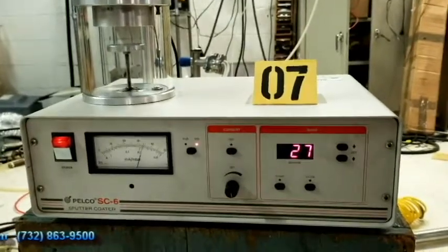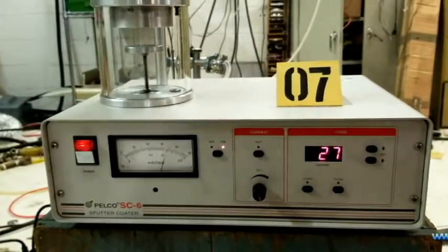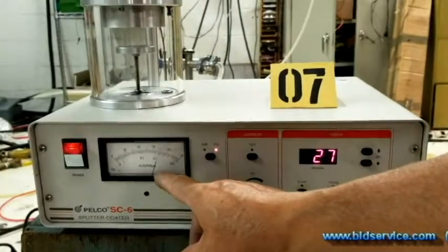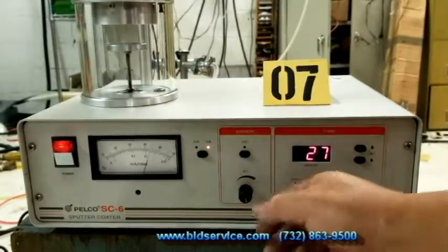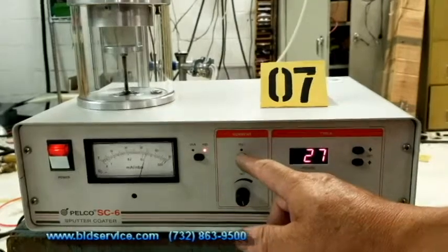This demo is for the Pelco SC6. Going over the front panel: here's the power button, here's the gauge that reads your millibars and milliamps, your set for the gas, and your test for your high voltage.